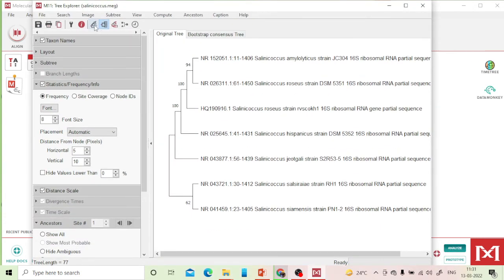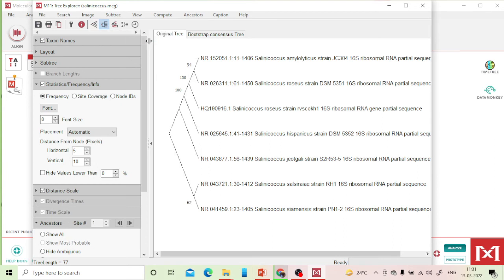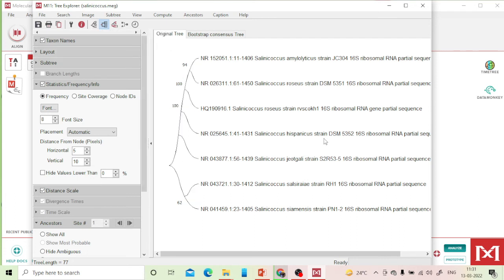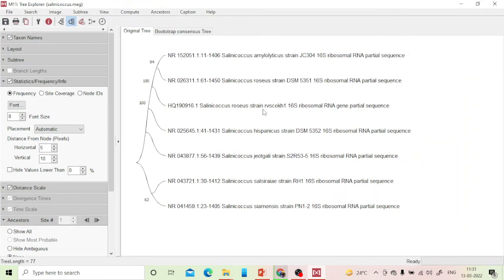You can change the tree representation — rectangular, straight, or curved — as you prefer. One thing to note: the taxa labels are very lengthy. If you edit the FASTA file names before analysis, you'll get a better representation of the tree. You can also do editing afterward for a more presentable image.